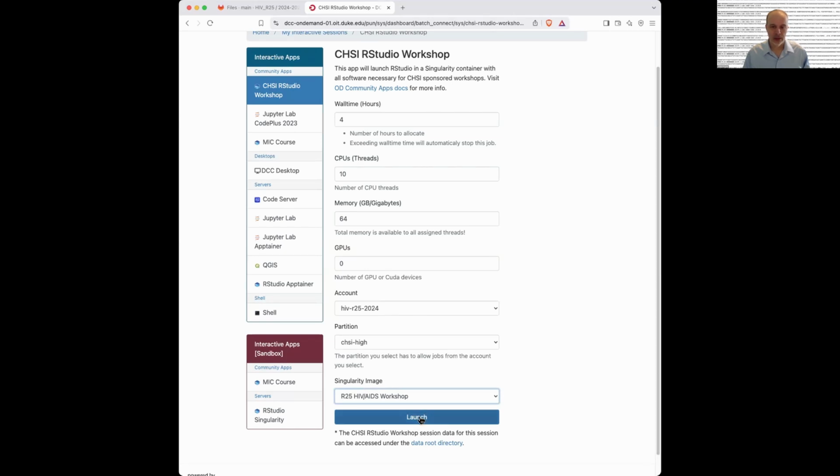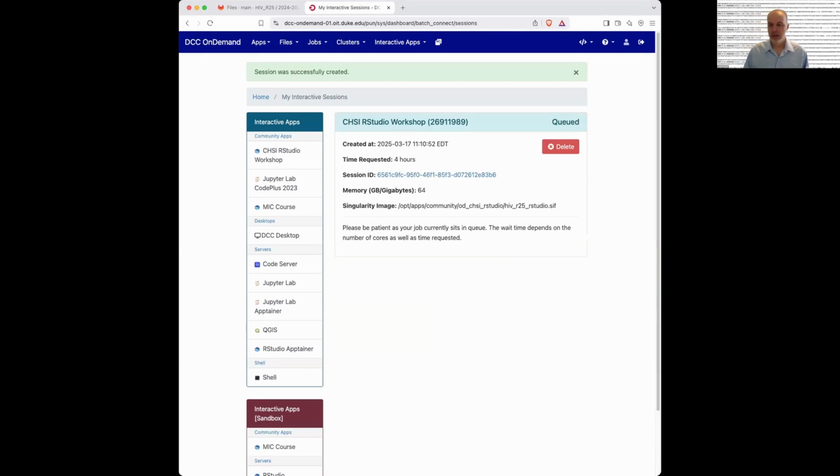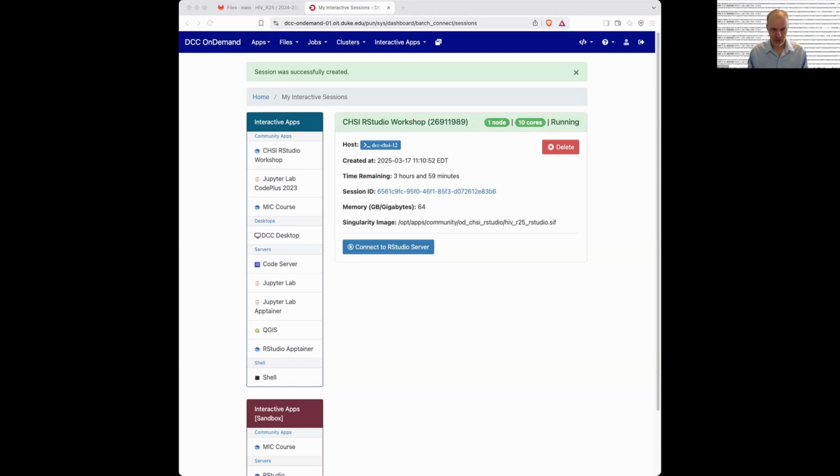Okay, so now I'm going to click on launch. I'm just going to give that a minute to start up. While I'm waiting for that, I'm going to check and make sure I cleaned up after the last time I ran this so that you're getting the same thing that I'm getting. Okay. So now I'm going to click on, anyone not here?